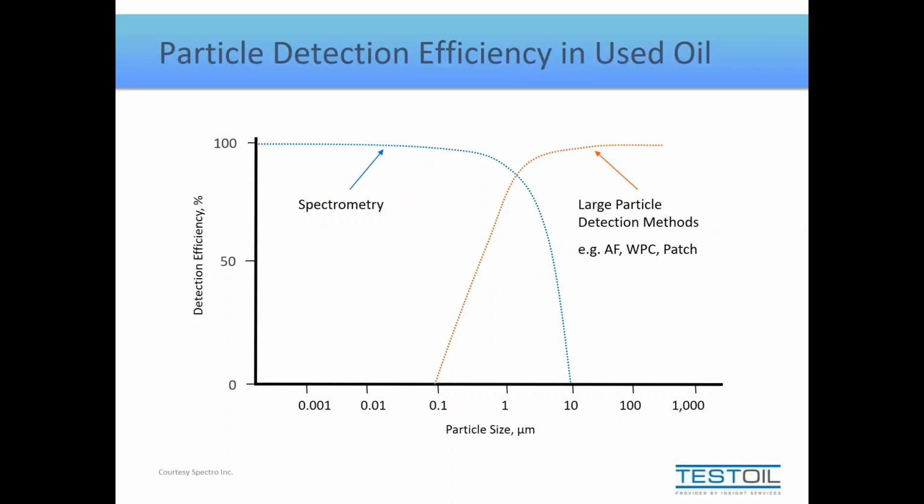Okay, I have another question here, and it's regarding the level of water in the oil sample. If there's a maximum number where you're still able to receive the results, and if there's a way to prepare the sample to minimize the interferences. Certainly that depends on the type of fluid.